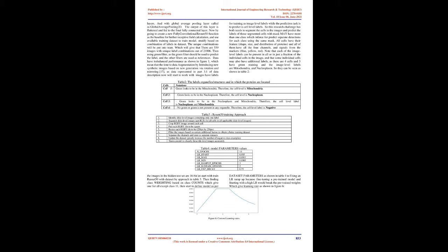While first applications used a smaller number of layers 18 and mostly operated on precalculated features 19, pixel-level analyses gave good results 20, especially using the latest training methods 21. Resnet can be reused for other image analysis experiments with the same marker proteins and magnification, or trained further for specific applications and can be applied for both classifying previously unseen compartments and inferring mixtures of localization patterns.